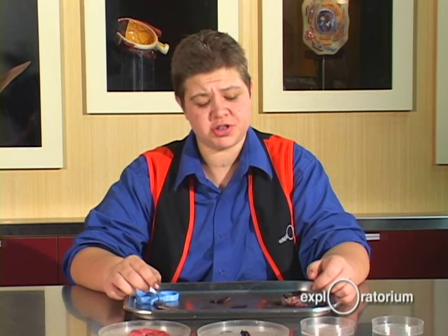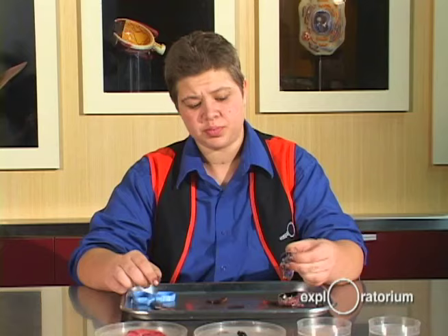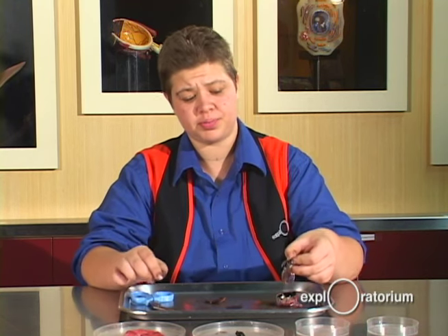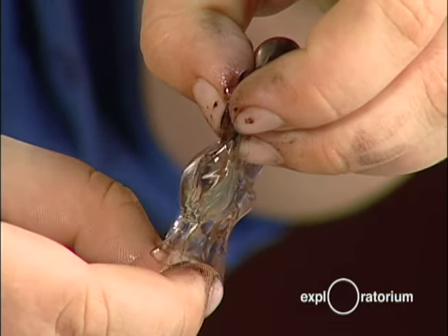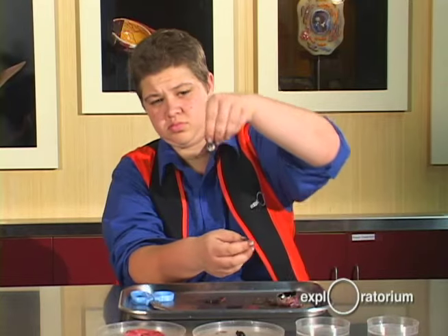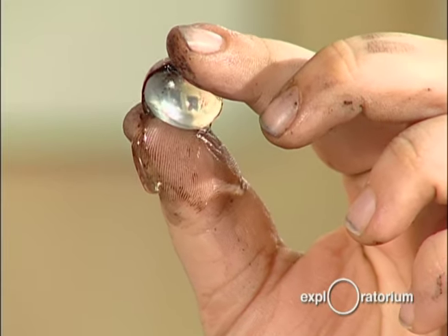Now I'm going to remove the lens so we can get a closer look. This jelly-like substance is the vitreous humor, which surrounds the lens. The vitreous humor is clear so light can pass through it, and it's a mixture of protein and water. The lens is soft on the outside and hard on the inside — it's kind of like an onion, growing layers every year. The lens's job is to help focus the light in your eye.